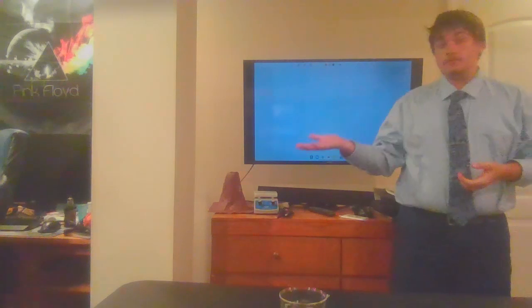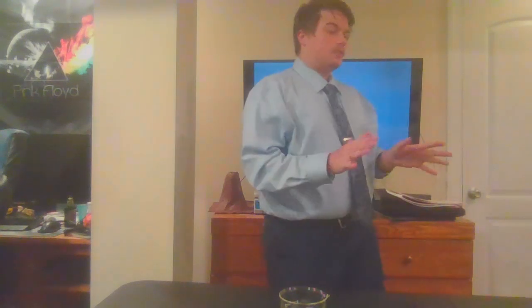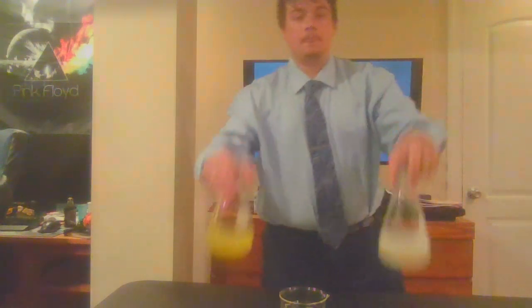Good evening, class. Today we're going to be continuing our lesson on different chemical reactions. So, I have a chemical reaction here, and I'd like you to determine if it's a combustion reaction, an acid-base reaction, or an oxidation-reduction reaction. Now, the chemicals involved here are solution A and solution B. Solution A contains a chemical called luminol.